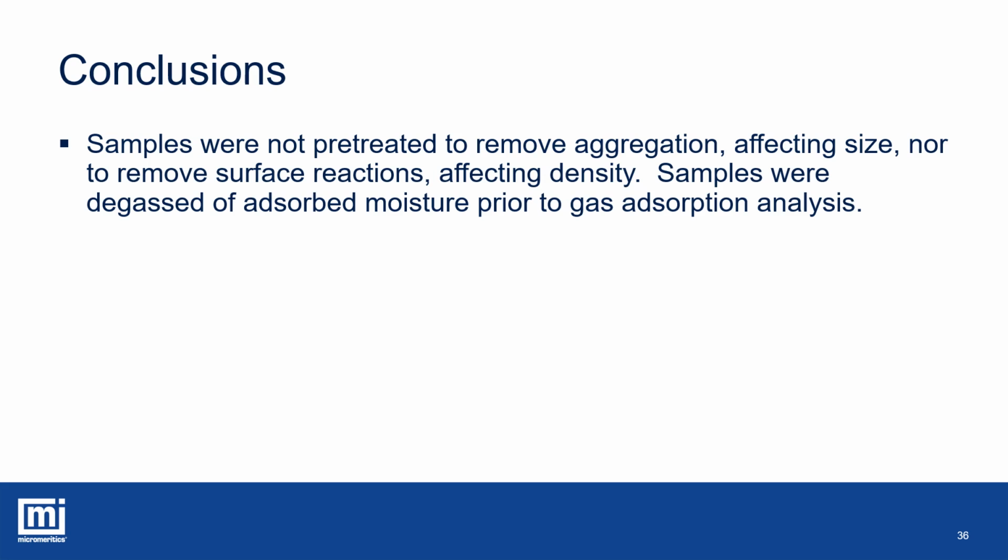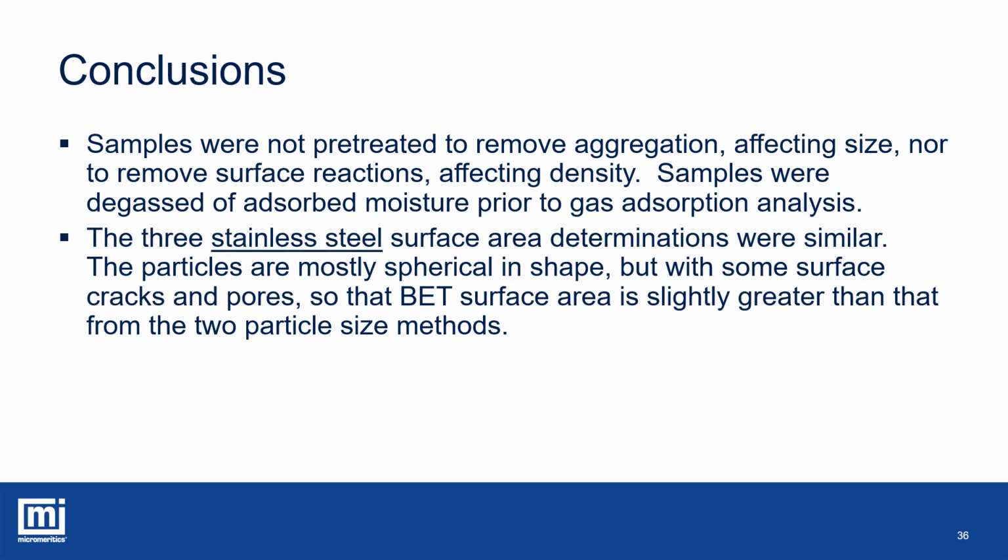The 3 stainless steel surface area determinations were similar. The particles were mostly spherical in shape. We saw that in the image, but they had some surface features such as cracks and pores. So the BET surface area was slightly greater than that from the 2 particle sizing methods.